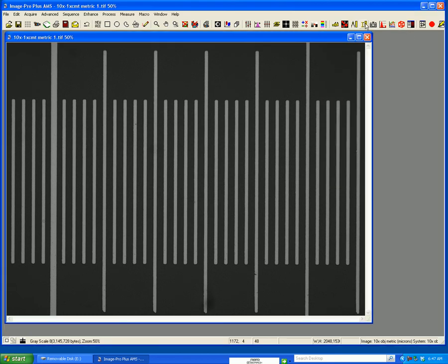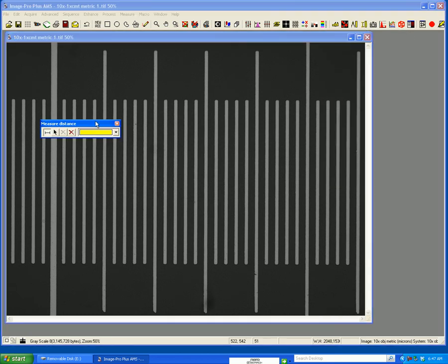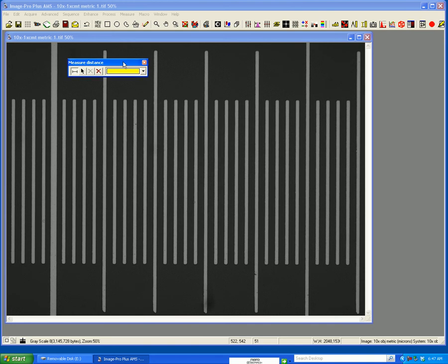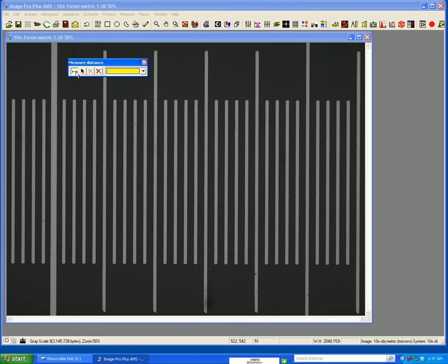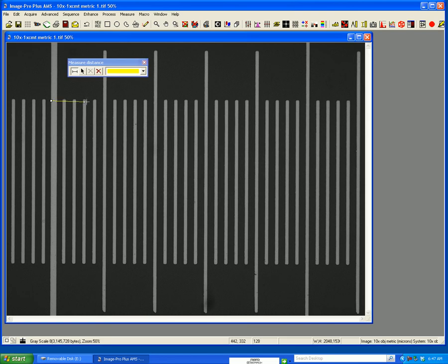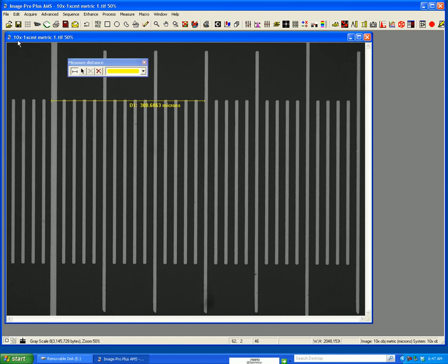So if I go to the barbell and the ruler, I can do a count size. If I put my cross towards an edge and drag it down here, it should be just about 300 units, which exactly it is.